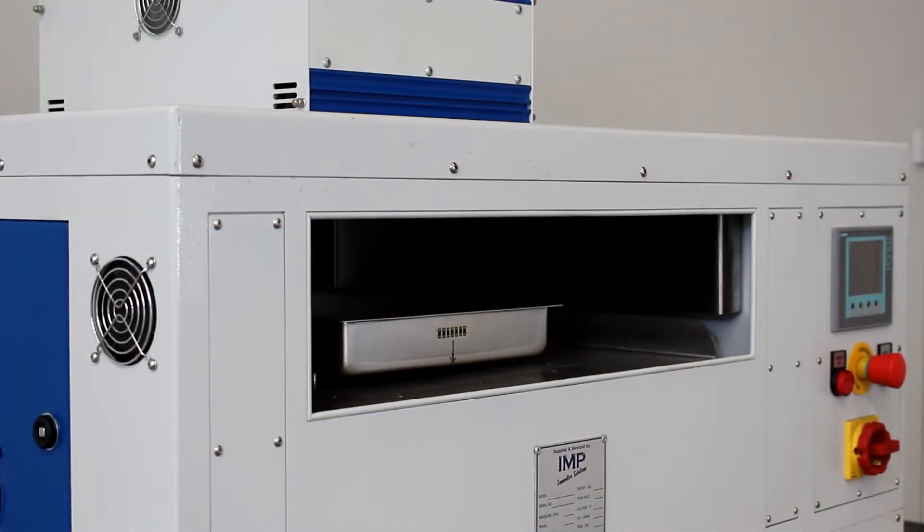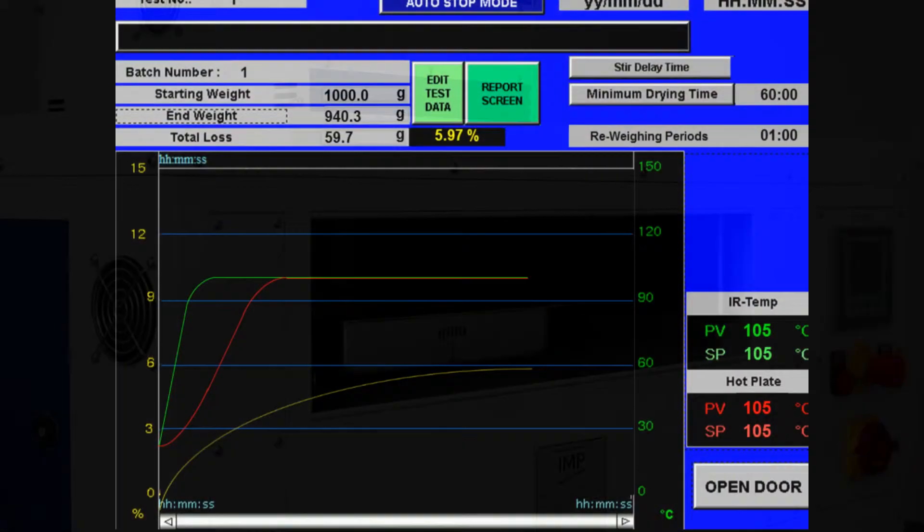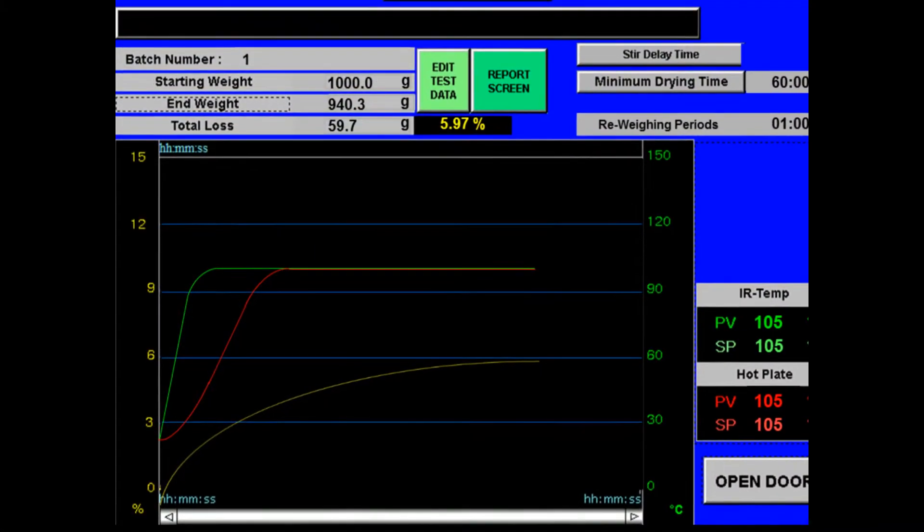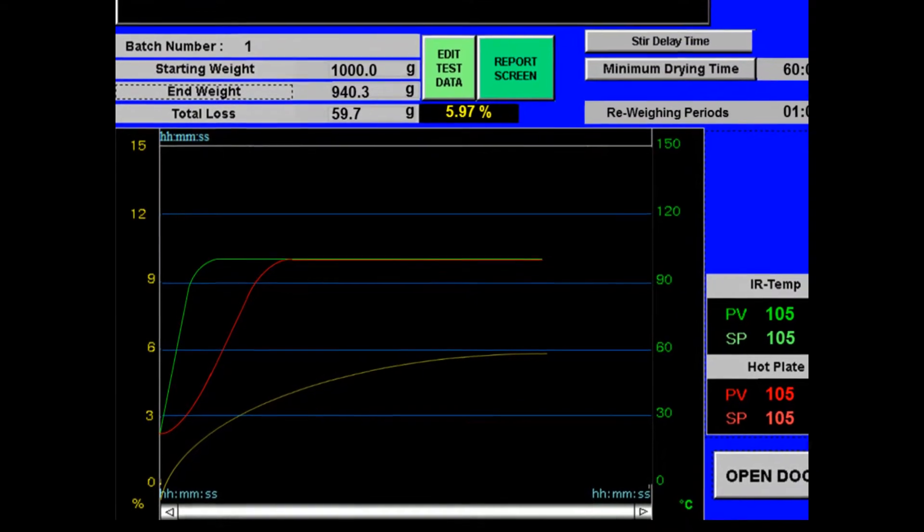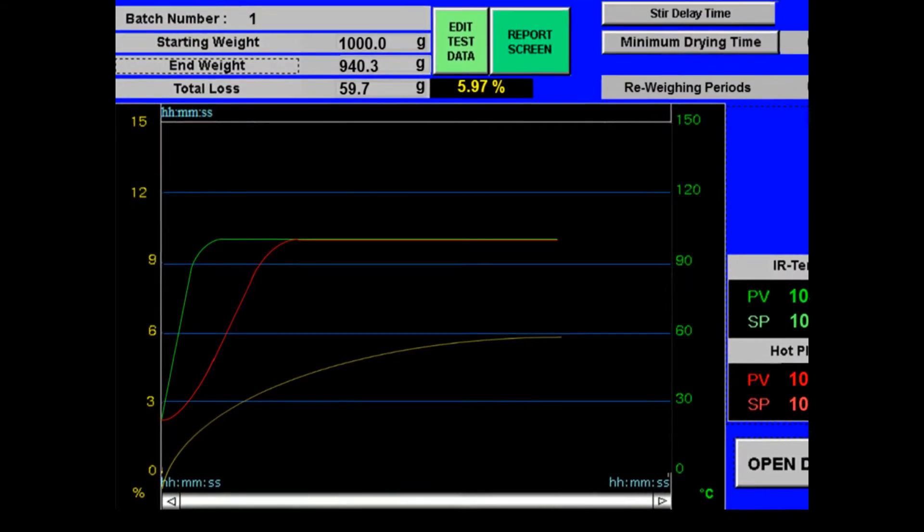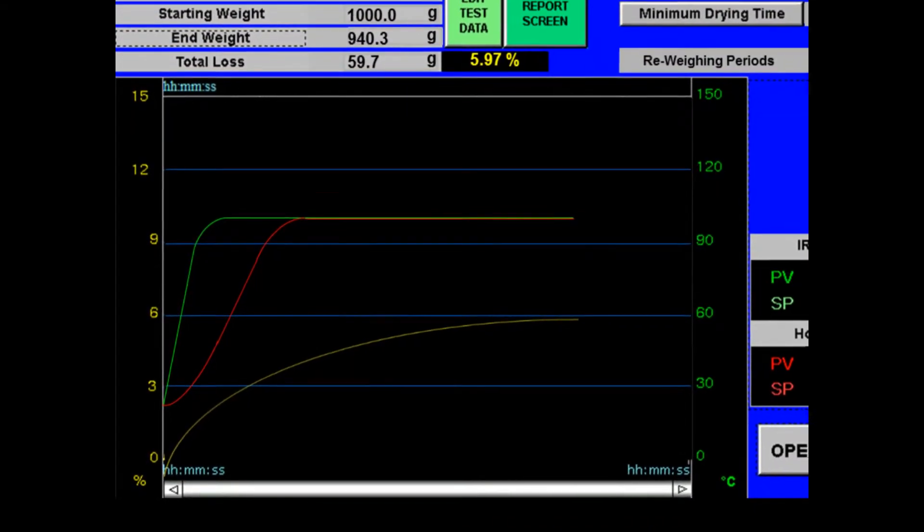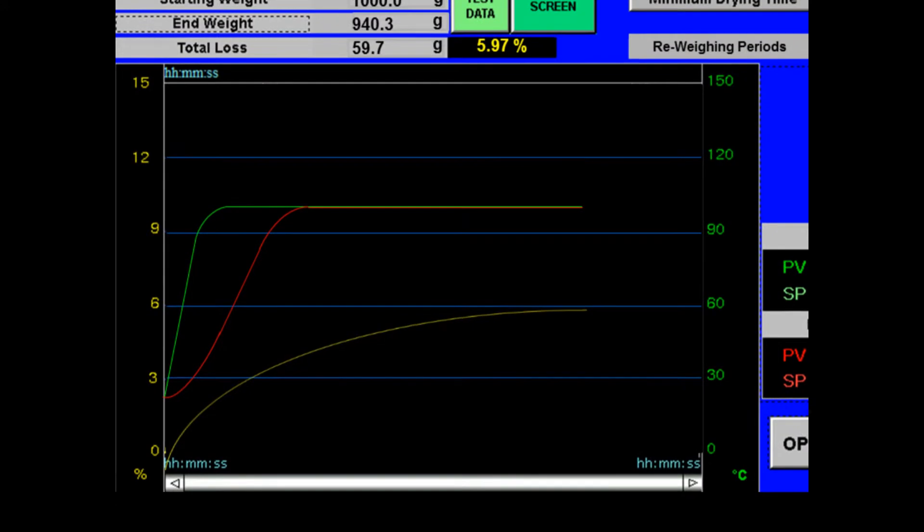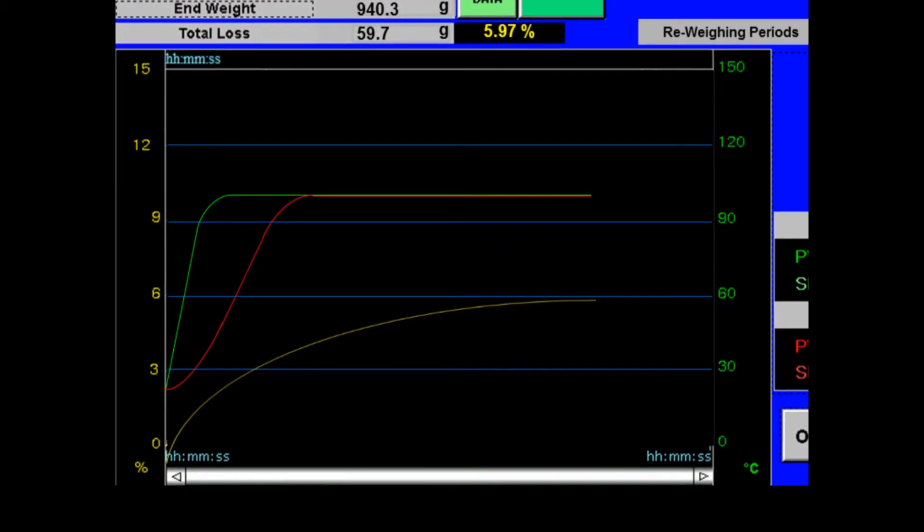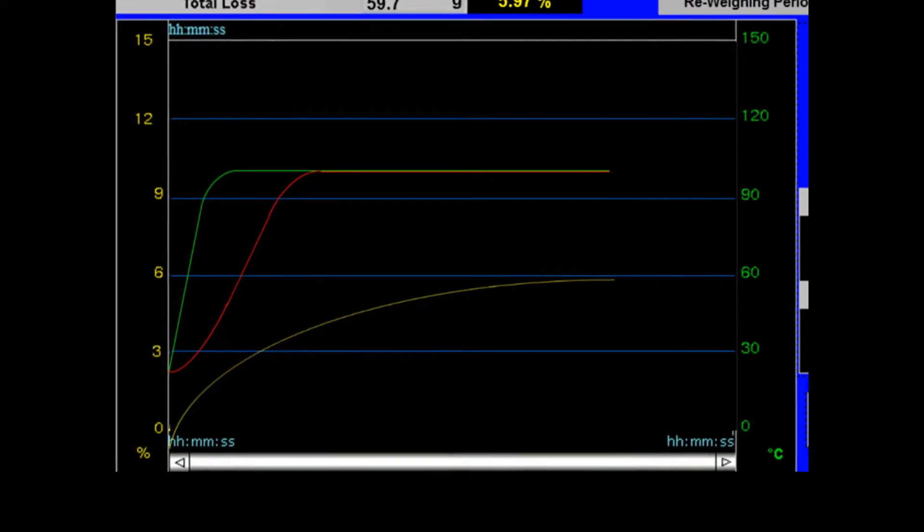The hot plate is pneumatically lowered, allowing for an accurate measurement. Temperature sensor feedback, coupled with sophisticated control systems, ensure that the sample is precisely heated to the desired temperature and maintained there automatically to ensure sample integrity.